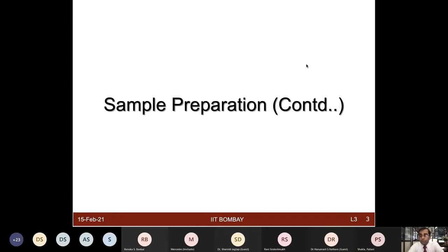So I'll continue about sample preparation, as we were discussing. I showed you some workflows for tissue proteomics involving the urea lysis method, and also bacterial proteomics work involving the trizol extraction method. But in the lab, whenever we start a new project for a sample we have not worked on, we start in an unbiased way and try out different extraction methods.